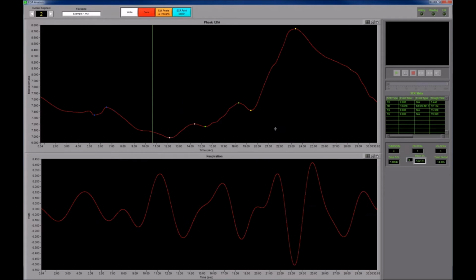And here, we can see that there is definitely a significant change in the morphology of this signal. It's become much more smooth, and that response that I edited out previously is not even there anymore. It's actually taken out that dip because that dip wasn't significant enough to make it through the averaging filter, the rolling filter. And so here we have just a single skin conductance response.